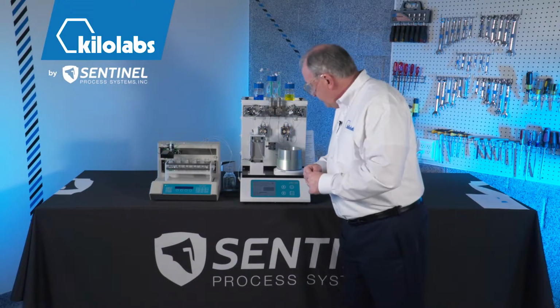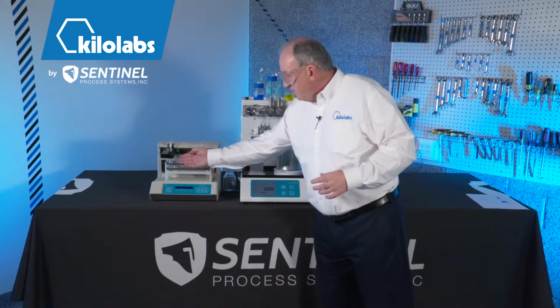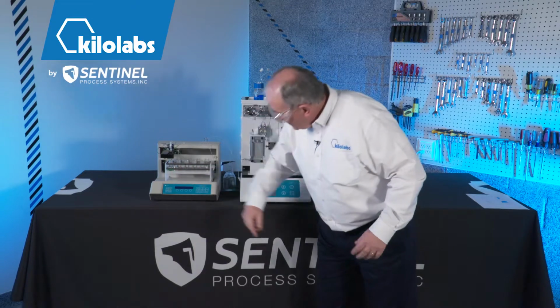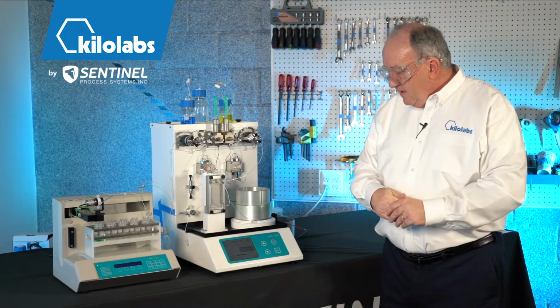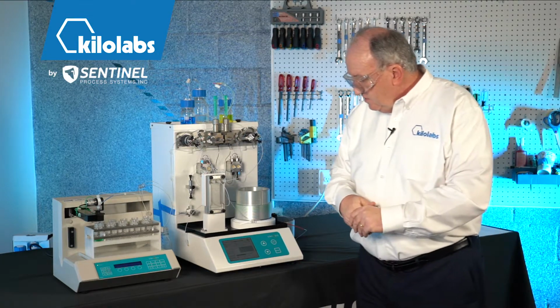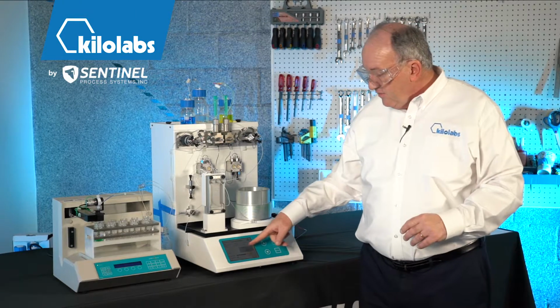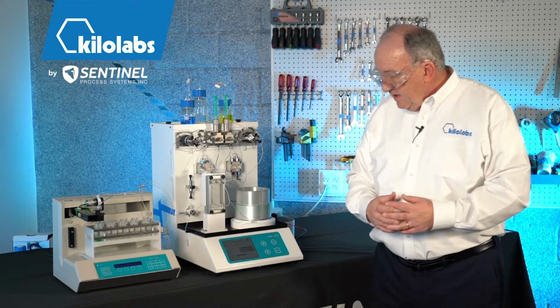So now we're 45 seconds from the end. We're still collecting our product over here in the collection vial. You can see it right here is the 4 ml that we've committed to this reaction. And now it should stop relatively soon, and you'll see this line change from collecting product to wash. So 15 seconds left.